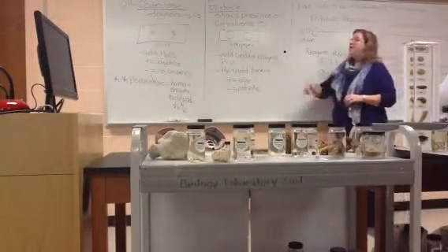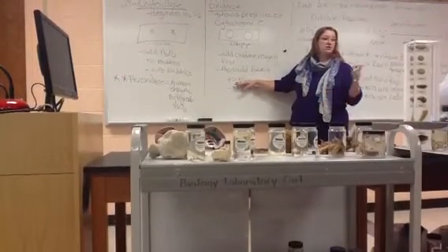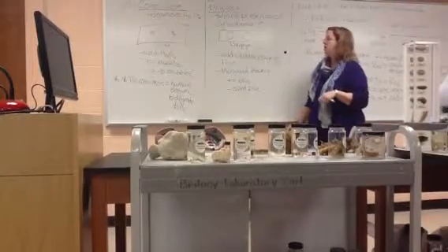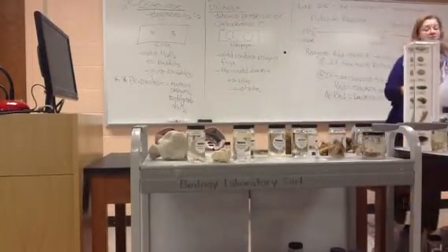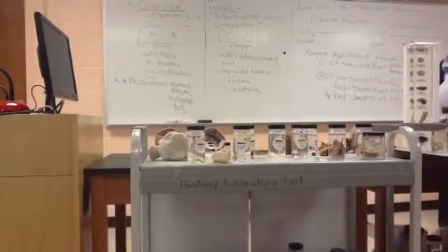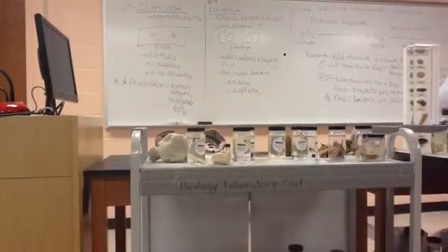And if the bacteria produce oxidase, okay, then that little wet spot's going to turn blue. Almost like your Simmons citrate, a really bright blue color the paper's going to take on. And if they don't produce oxidase, then you're not going to have any color change. It's still going to look like wet paper. So no blue color. And that one's on page 87 of your photographic atlas. Oxidase is on page 87.